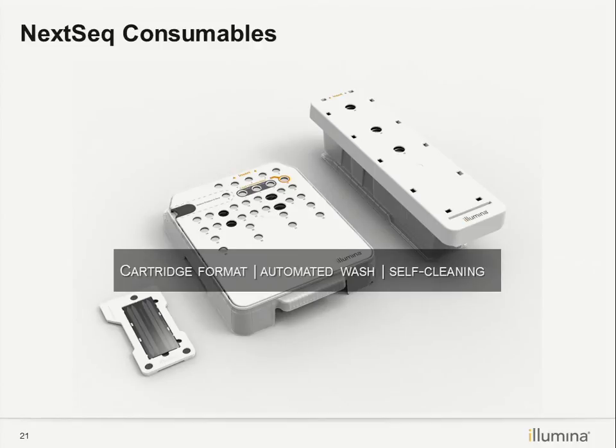If you do, you have to prepare the custom sequencing primer. Otherwise, you will not be able to sequence it, because if the sequencing primer is not compatible, the primer cannot bind, and you are not going to get any signals from sequencing. So these three grey wells are for the custom sequencing primers.